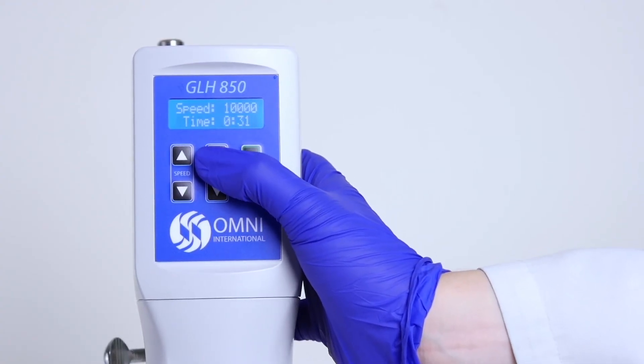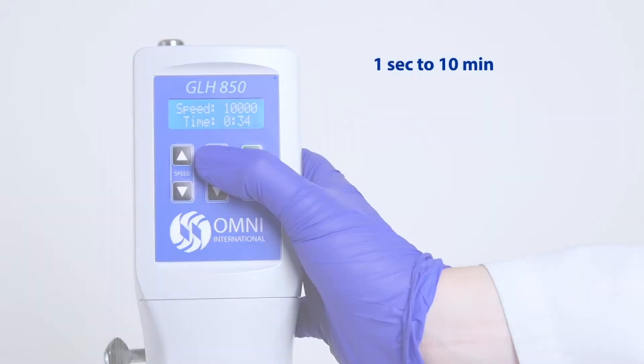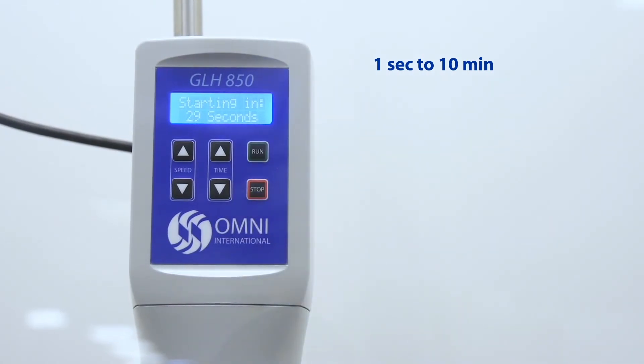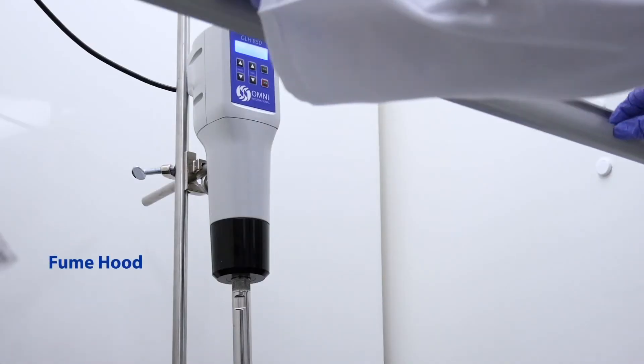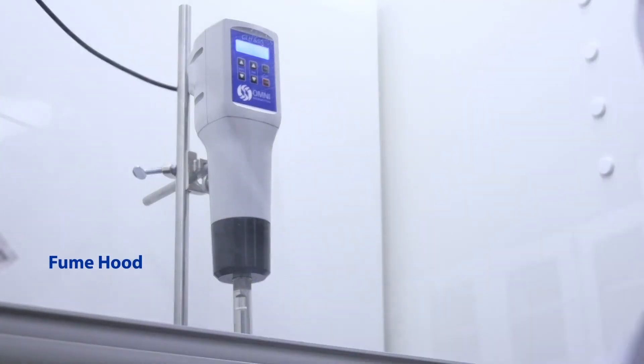The Omni GLH 850 features a timer that can be set from 1 second to 10 minutes and also features a delayed motor start time for applications requiring a fume hood during homogenization.